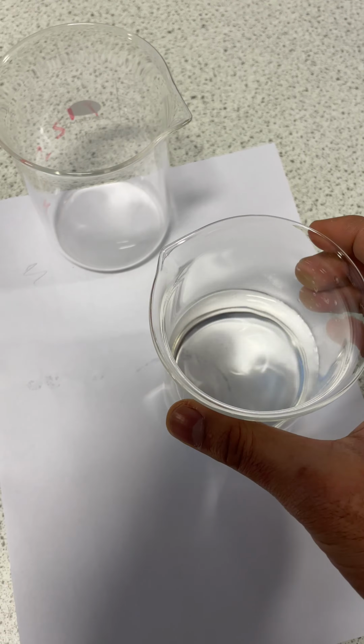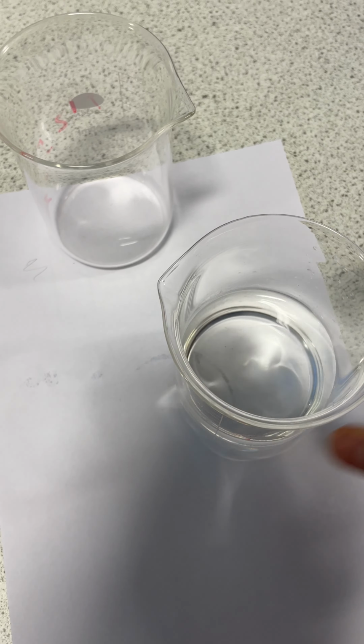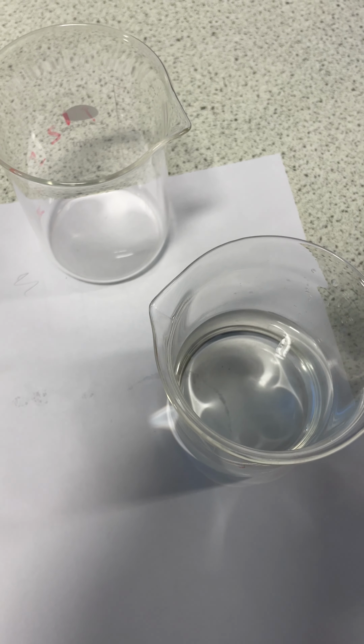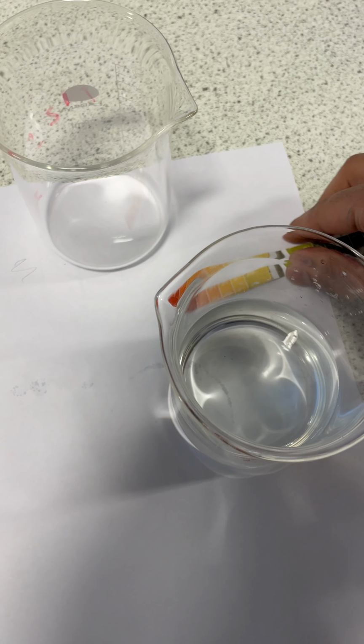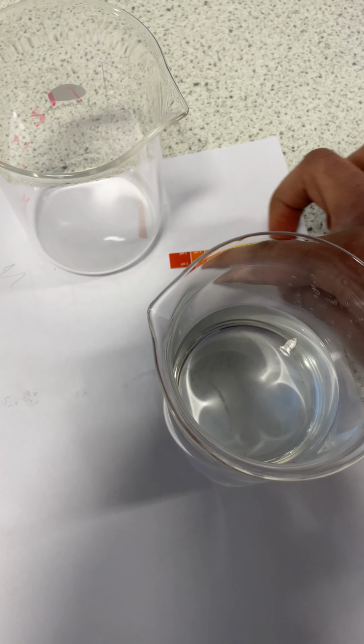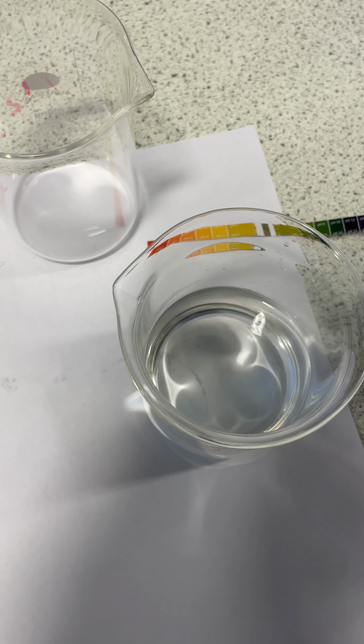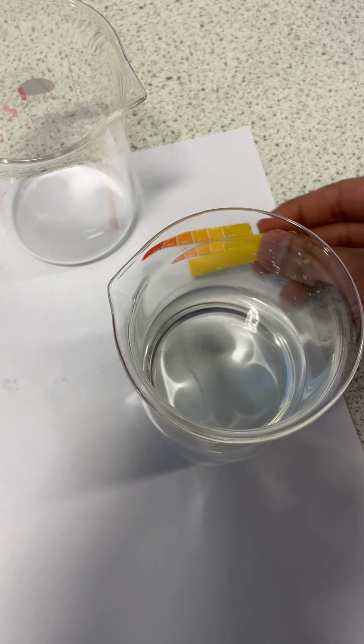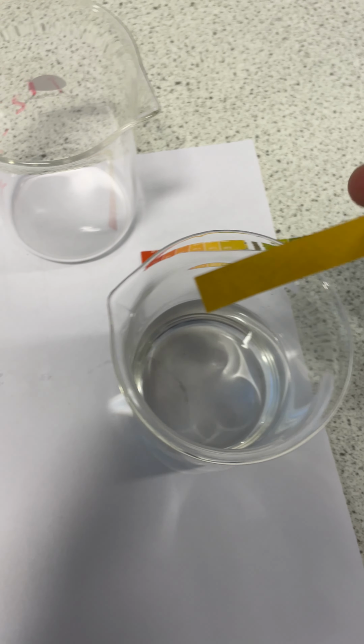I've got some hydrochloric acid in this beaker, and if I take this paper, just place the pH scale over here. We've got 1 going all the way to 14, 1 being red, 7 being neutral green, and 14. So if we know it's an acid, it's going to be on this end of the spectrum. So we can expect a red or orange.